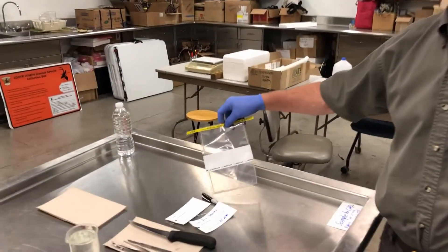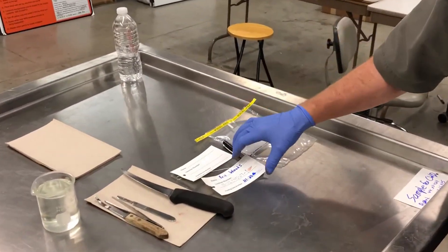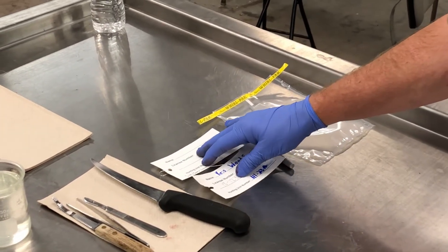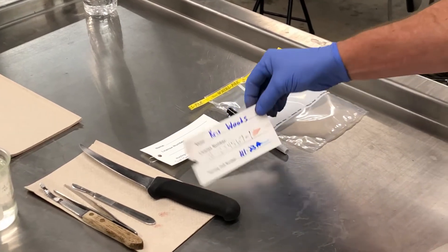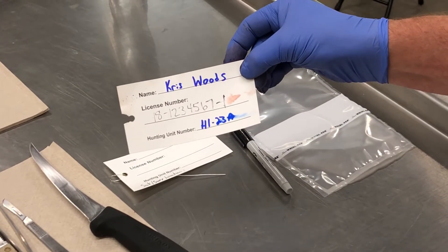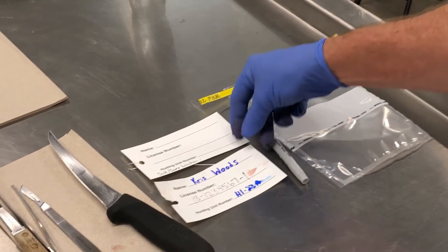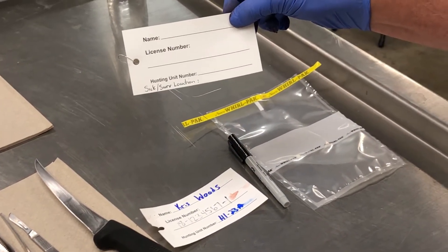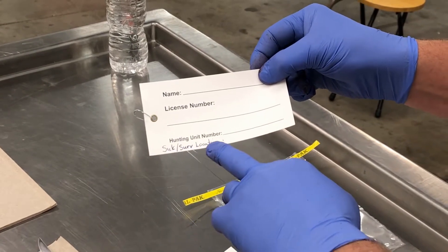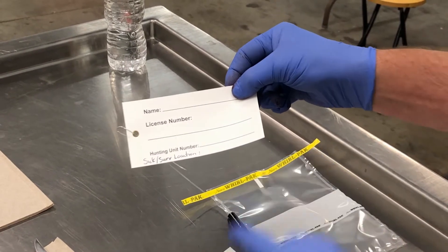Before we get going, I want to mention a couple of things. It's very important that when you collect a sample, you record the information for that specific sample. In this case it's a hunter-harvested elk, so we want the name, the license number, and the unit for that animal. If it was a sick animal, you would record your name, an area, and the exact location for that animal.